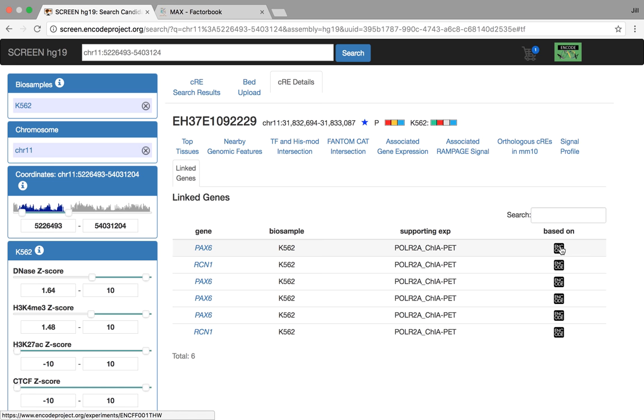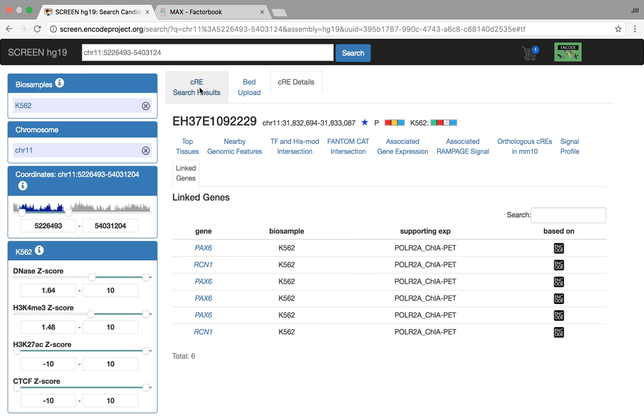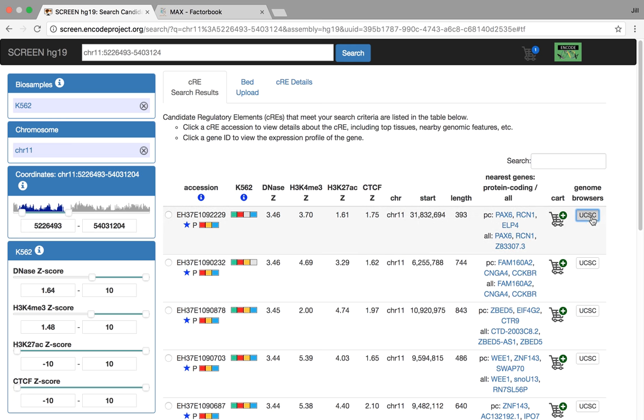Okay. So that's the CRE details for you. A lot of people when they come to this, the most important thing in many ways is to look at this in the genome browser. And we've tried to build a bunch of tools to help you configure the genome browser, give you the best experience when looking at the CREs in UCSC.